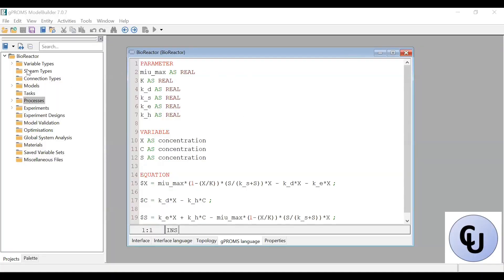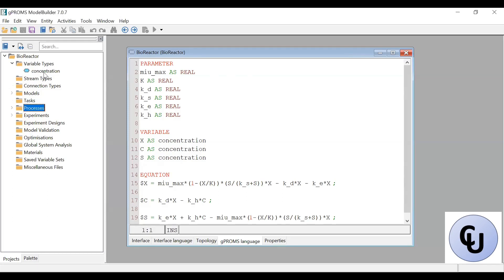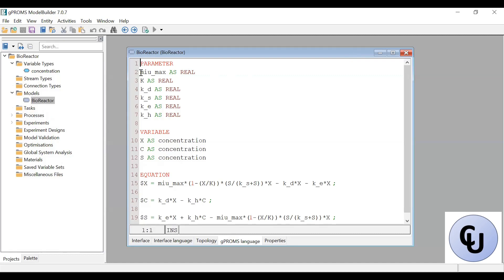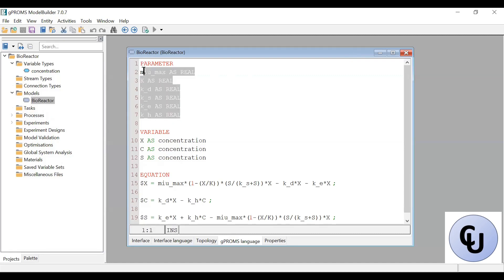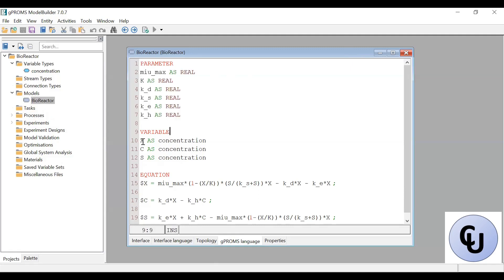I already created the model. For the bioreactor, the variable type concentration is the only variable type that I need. The model bioreactor is this. I've declared the parameters μmax, K, Kd, Ks, Ke, and Kh all as real. Then the variables X, C, and S as concentration.